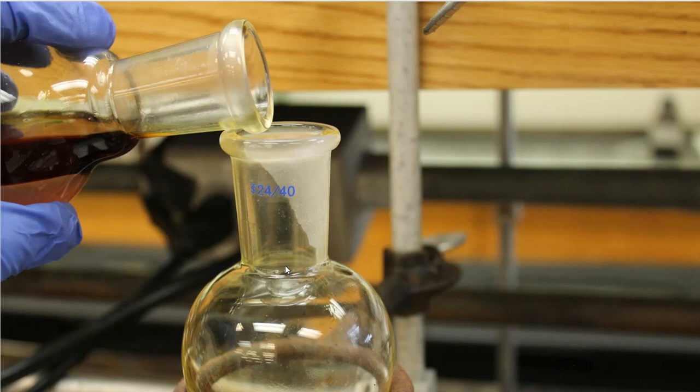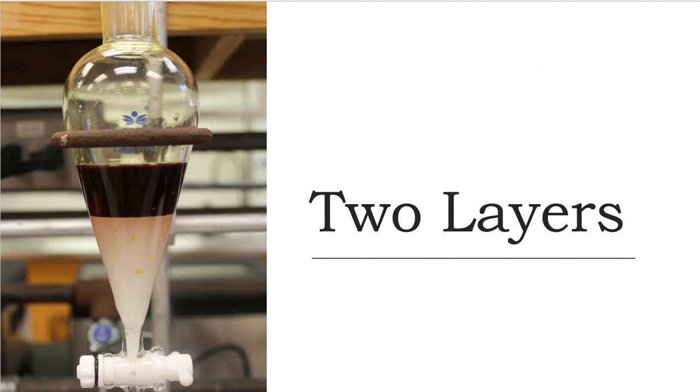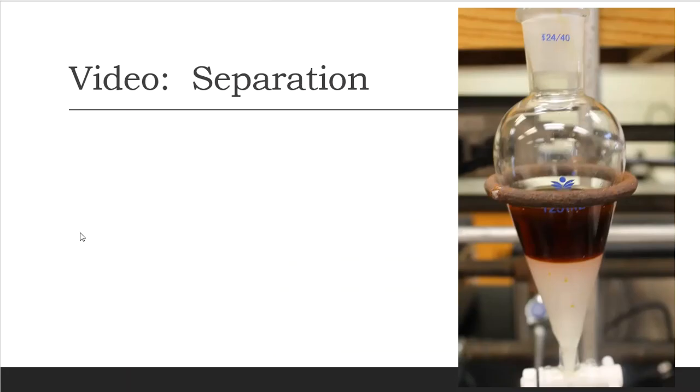Okay, so I took the product that was in that boiling flask and transferred it over to a separatory funnel. That's what you're seeing in the image right now. I did have a little bit of residue left over in that boiling flask, and that's what you're seeing in that image. When I poured it into the separatory funnel, two layers began to form. Here we have the dark layer on top and a whitish, kind of milky layer toward the bottom of that separatory funnel. And it's now my job to separate those two solutions from each other, because that's why we call it a separatory funnel, right?